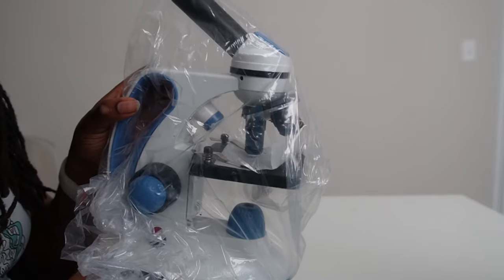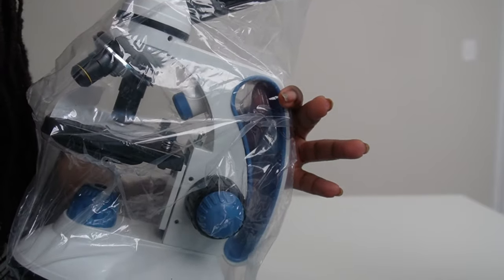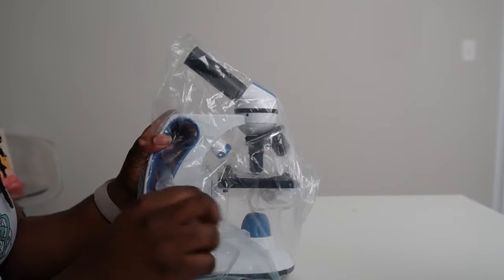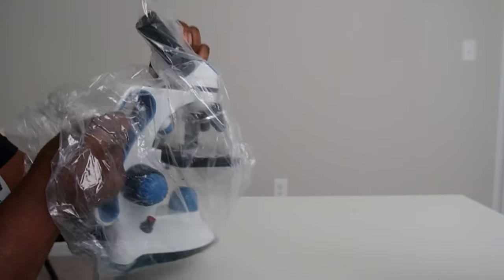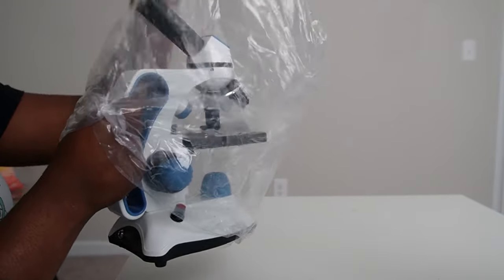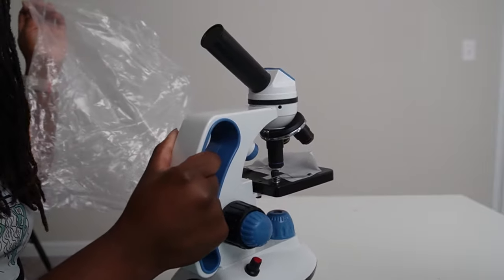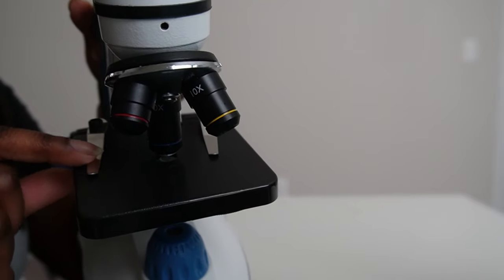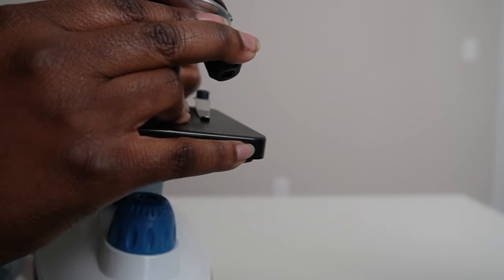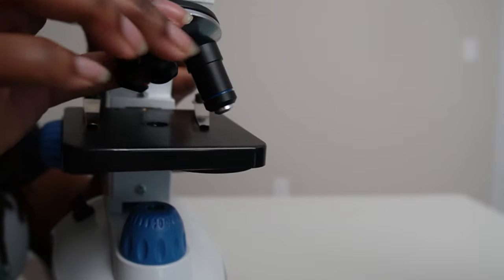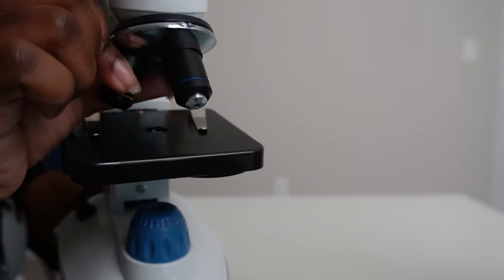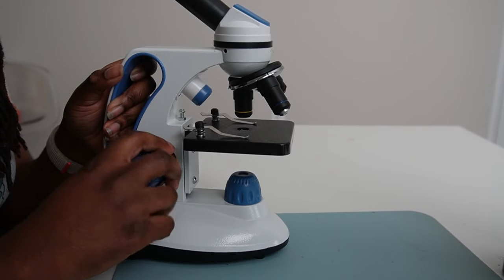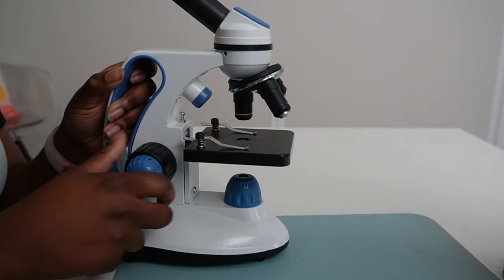This is the microscope out of the box. Everything is already installed and attached, so there's no assembly required. It does come with stage clips for you to put your specimens, and the objectives are already attached to the holder. There are fine and coarse adjusting knobs to adjust the stage.